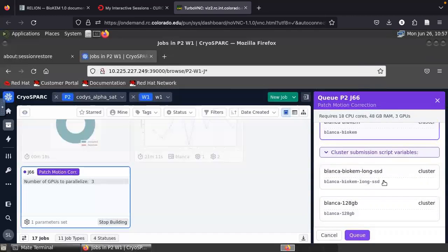All of the other nodes are configured to use the SSD for particle caching, but the size of each SSD is different depending on the node, and a lot of them are pretty small, so it probably won't work very well unless you use this one, and even then it might not be big enough to cache all your particles. So usually I would just turn SSD caching off, but if you want to use it, you can try it here. If it doesn't work, just turn it off and go without it.